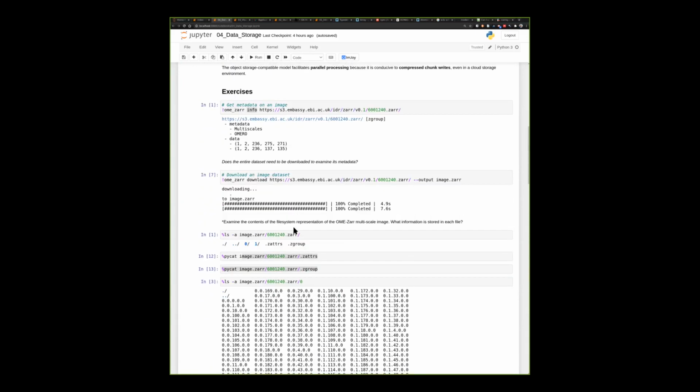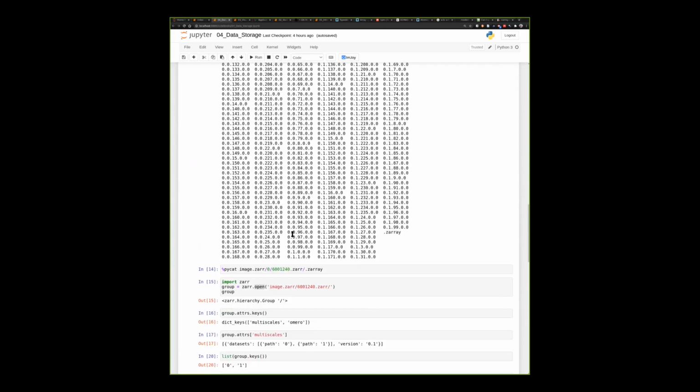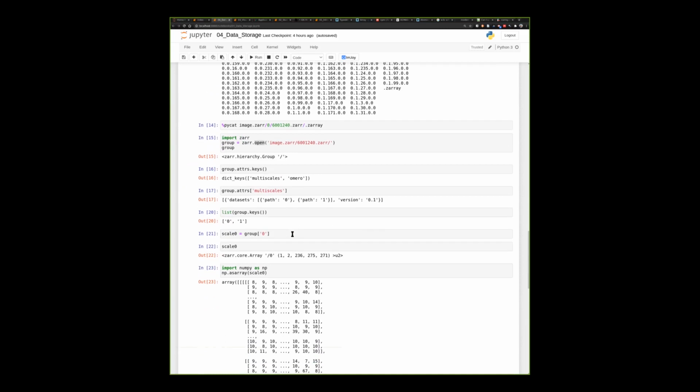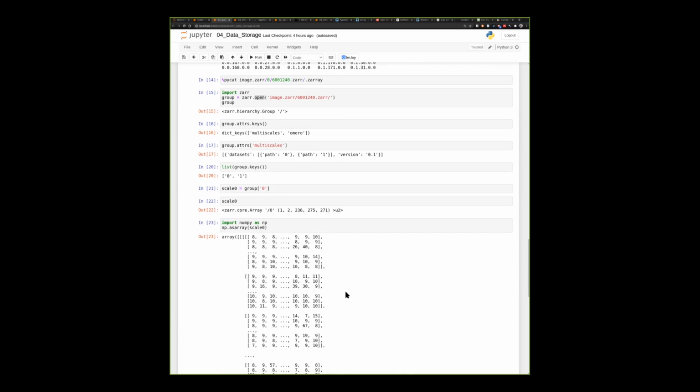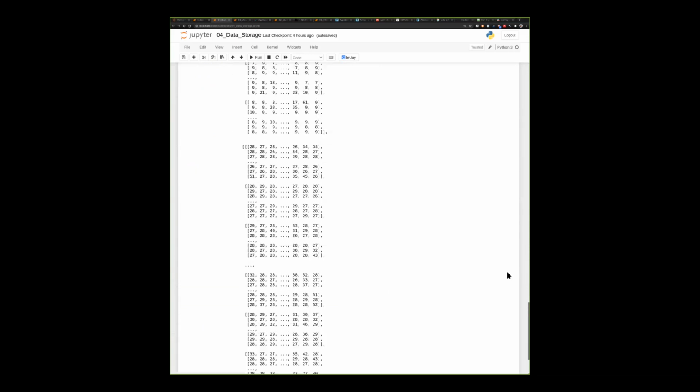Most of the commands are here. You want to run them and take a look at them. This was the notebook that had some issues in the last session. Some folks, when they ran this command, it put this folder inside this folder. I tried to update the commands here, but if you have issues, just speak up and we'll see if we can get them resolved. So let's take 5 minutes and see if we can understand how ZAR works.